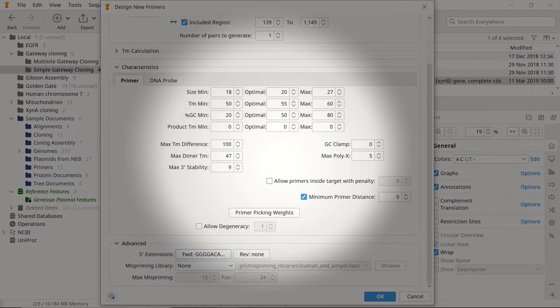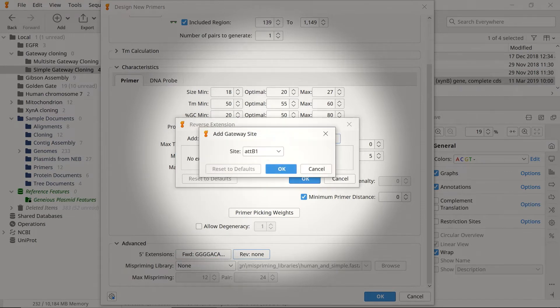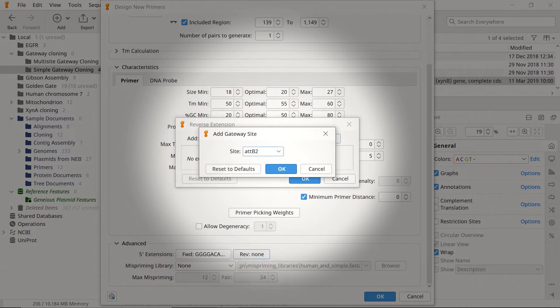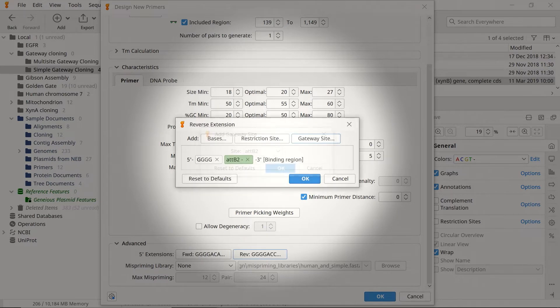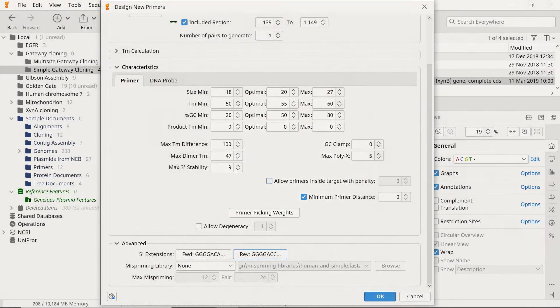Repeat this process for the reverse primer. Again, select Gateway Site. But this time, ensure you select an antisense option since this is the reverse primer. The attB2 site is suitable for most simple gateway cloning experiments. When you're happy with the primer settings, click OK.